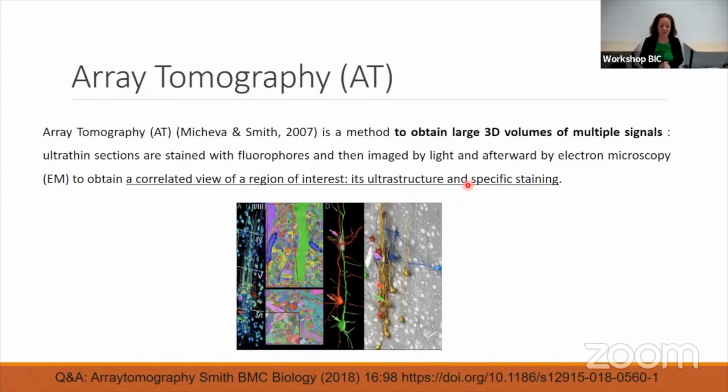Array tomography allows to explore a large volume of sample, like tissue, to obtain important information at the ultrastructural level, and to target a region of interest with a light microscopy, and to observe it after in electron microscopy with the SEM.